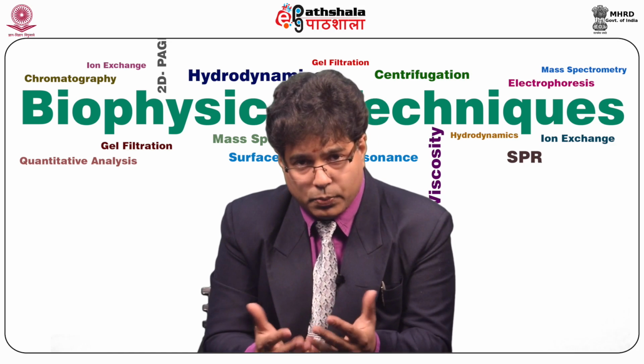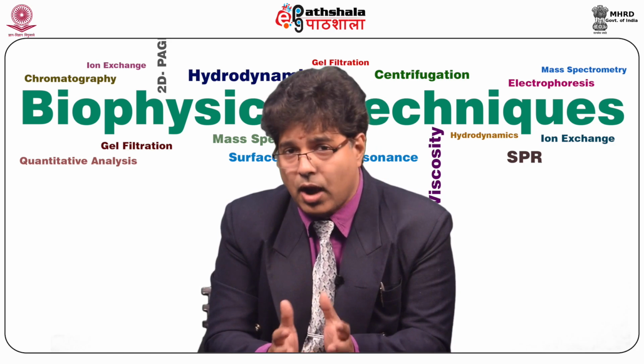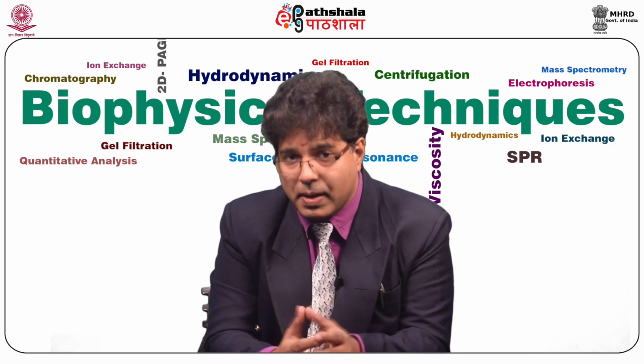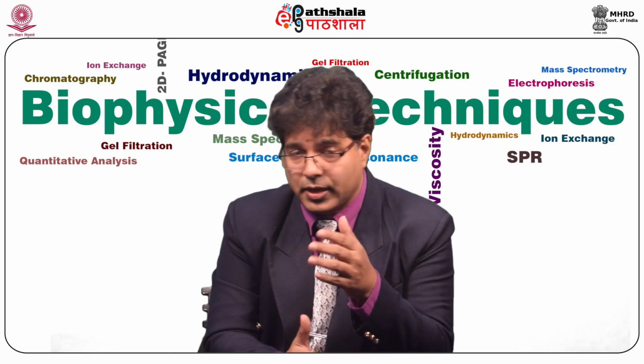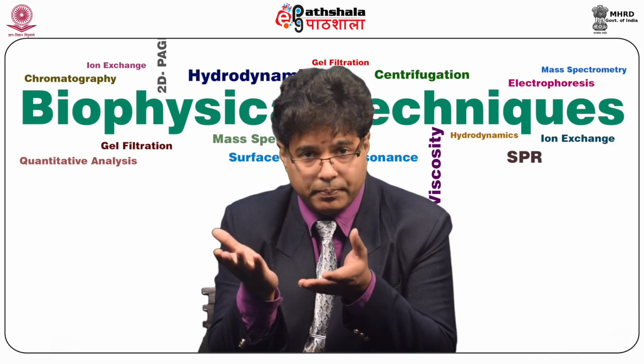Initially, the mass spectrometers which are used today are not the way they were pursued about 100 years back. Therefore, it's very interesting to understand how this instrument has evolved over the period of time.